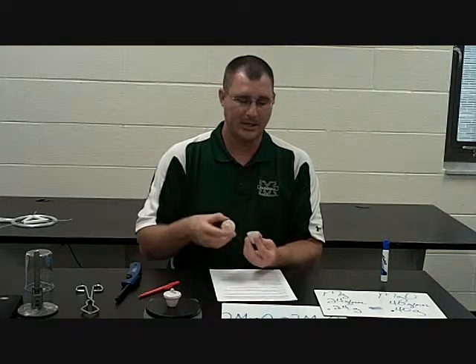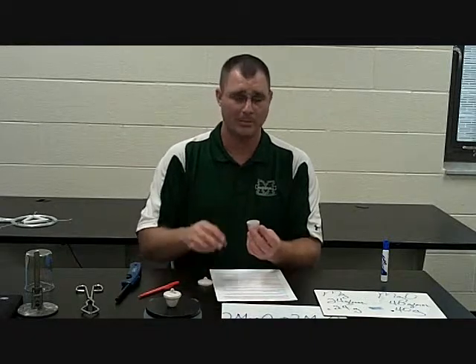The other thing is, and some of my students didn't get a great result, but heat rises, and when I'm burning that magnesium, if I've got the lid over too far or I'm too anxious and I keep peeking, the hot air will carry some of that soot out, right? Some of that leftover magnesium oxide, and I'll actually lose weight that way. And in a fire outside, most of it burns away in ash. So that's the reason you have a loss of mass there, and that's the reason we actually gained mass here.